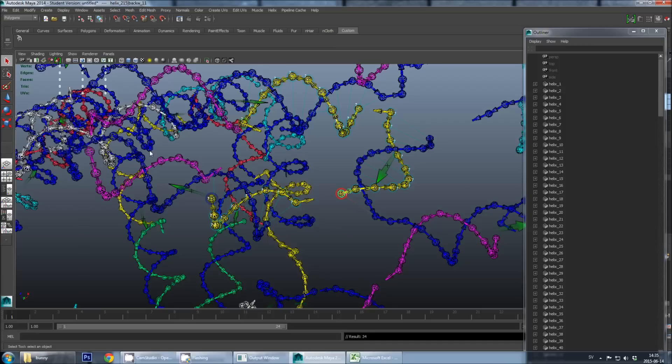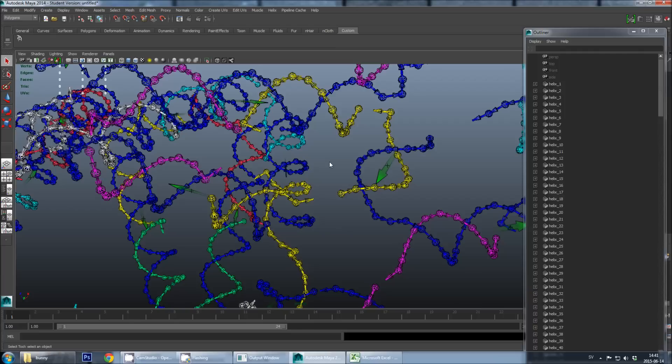So using this method you can manually modify your breakpoints to get a good staple quality. But now I will instead show you how to automatically generate multi-edge staples using V-Helix. So in V-Helix the staple breakpoints are actually added when you import the RPoly file into V-Helix. So if we want to change the staple breakpoint generation, we have to redo the import, but with some other options.